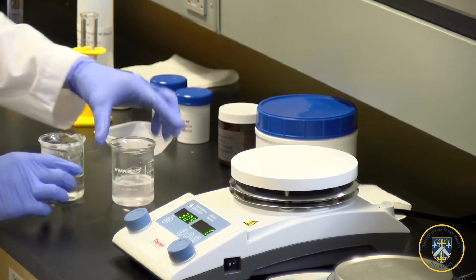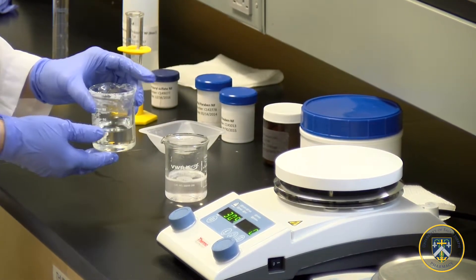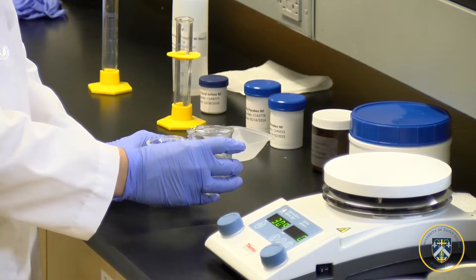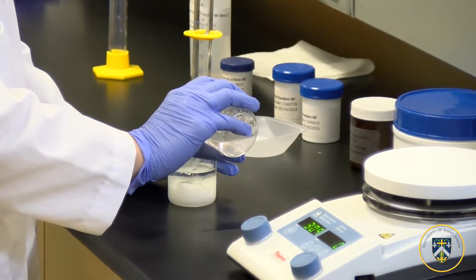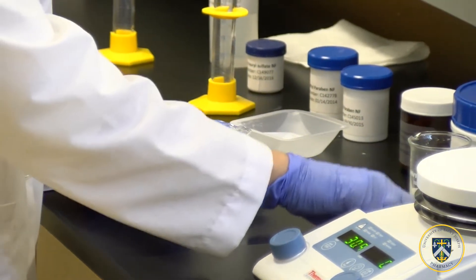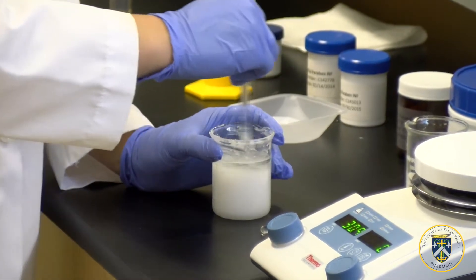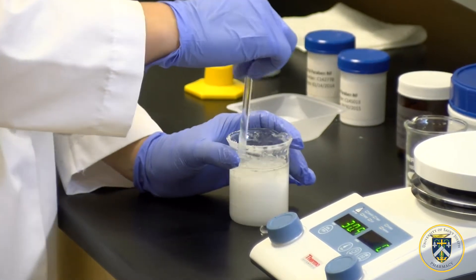Now that we have a uniform mixture with our water solution and our wax solution, we will be adding beaker number two — our water — to our wax. Now you have to stir it slowly until it has a thick but smooth consistency.